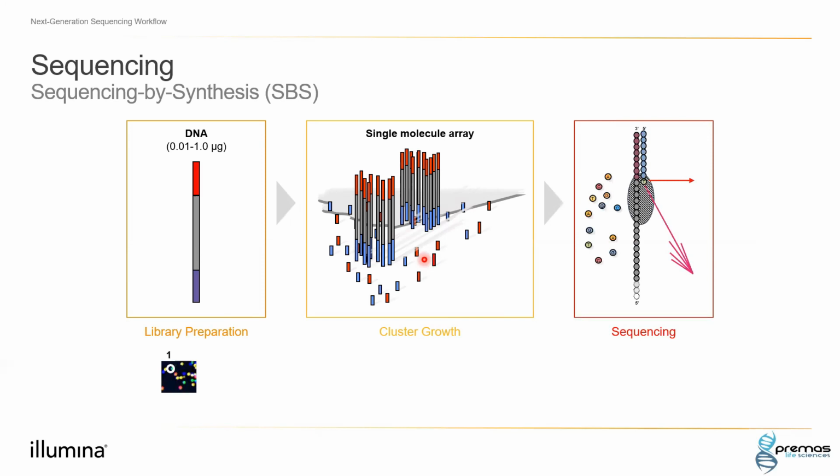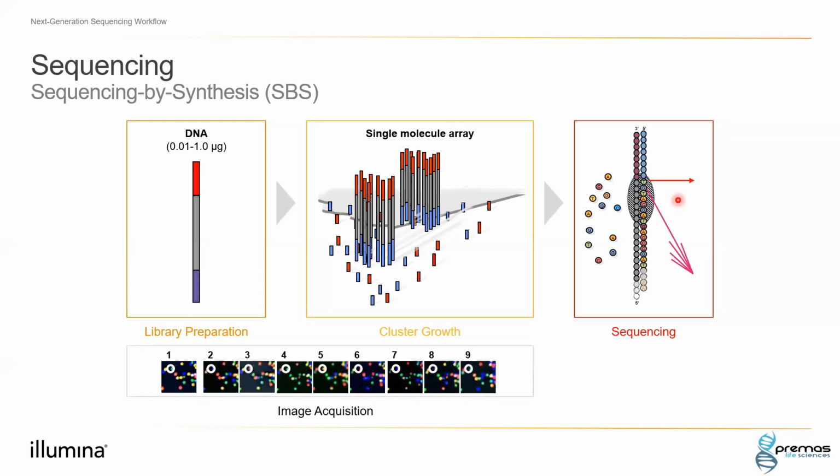So your individual nucleotides go ahead and bind, the LED excites, the camera will image, and then you will have your base call. So basically, it is sequencing by synthesis. It sequences one nucleotide at a time, so in some cases like homopolymer regions, it basically has no effect in your SBS. Other sequencers like Ion Torrent are affected by homopolymer runs, but Illumina is not, due to this SBS chemistry.